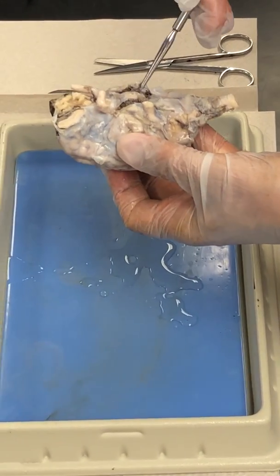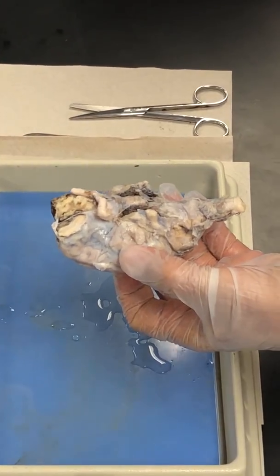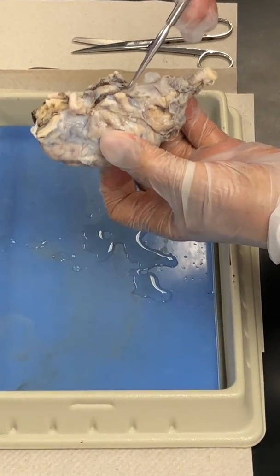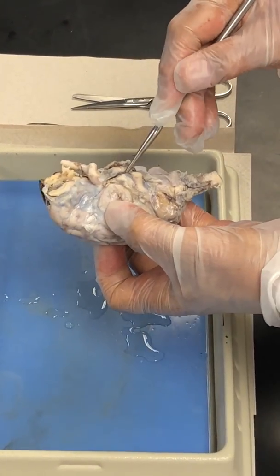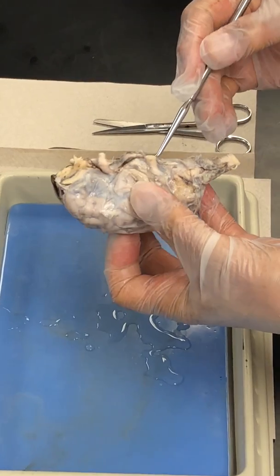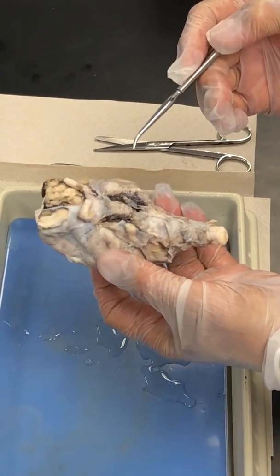Got it? If you want to study things carefully, you got to do some cleaning. By the way, when you do cleaning, use the probe. Don't use the needle, don't use scissors or anything like that. Use the probe, because this does not damage things. It just removes the tissue and cleans it up. So if you do some cleaning, you'll be able to expose the pituitary gland, and you can see that's your pituitary gland, or the sheep pituitary. Okay. If you are really good, you can try to identify the other 10 cranial nerves.